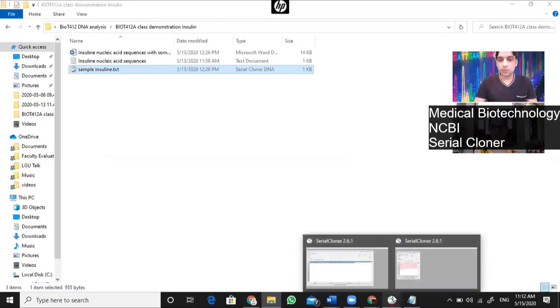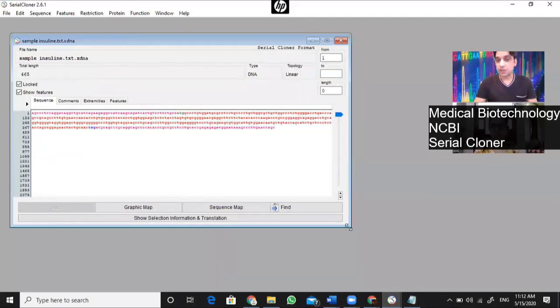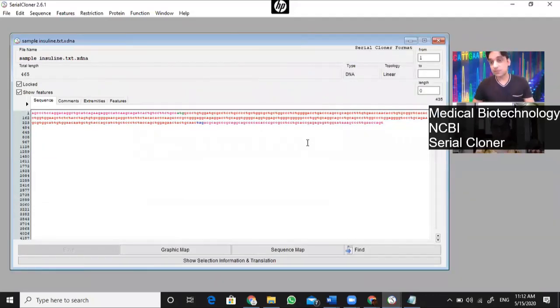Because when you choose to stay in one particular area of research, whatever you are generating in the meanwhile, these are your power tools. This is a very simple file, but I can make it very complicated over time. I can put more features, more information, and more background data in that file.